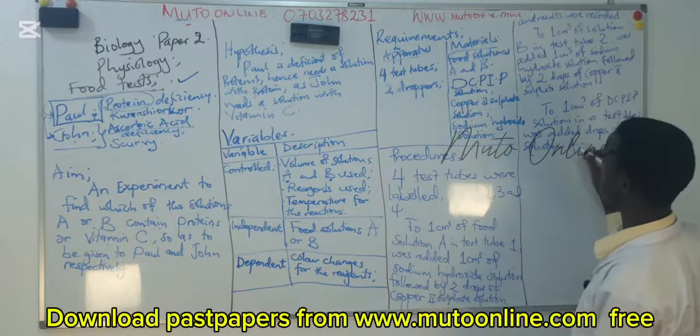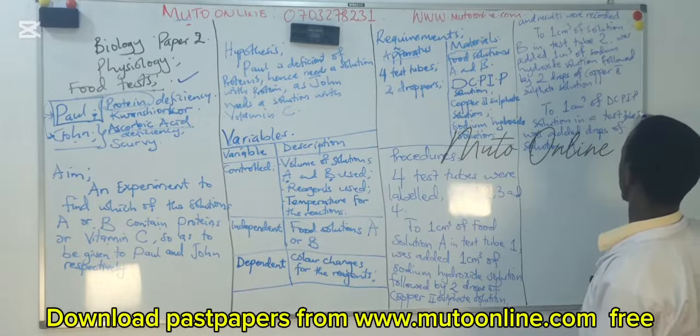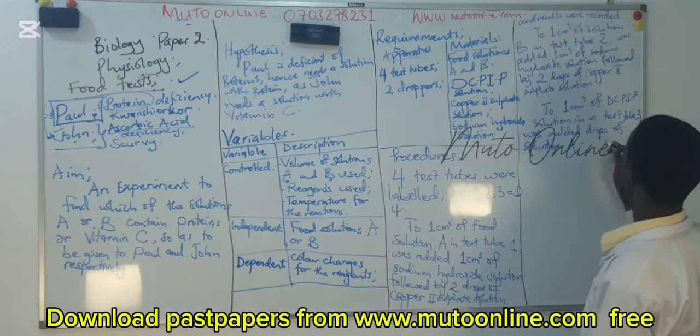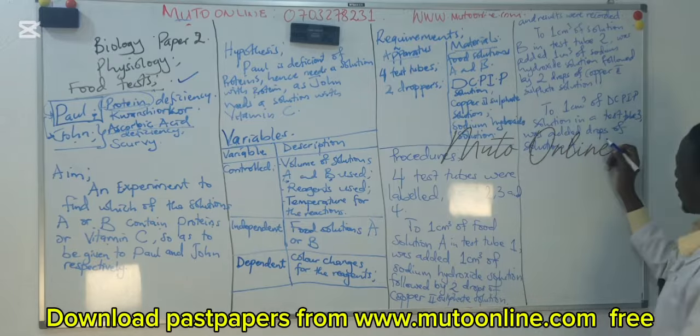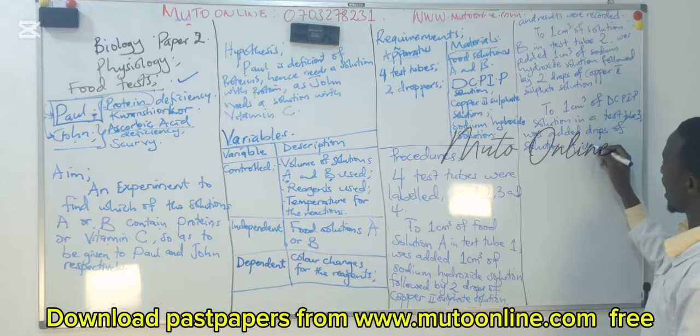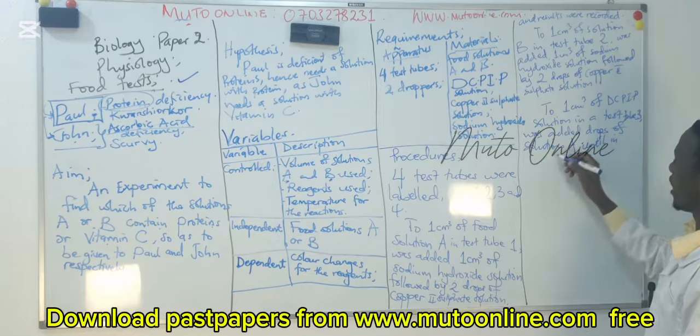This time it is solution A. In test tube 3 was added drops of solution A until in excess.